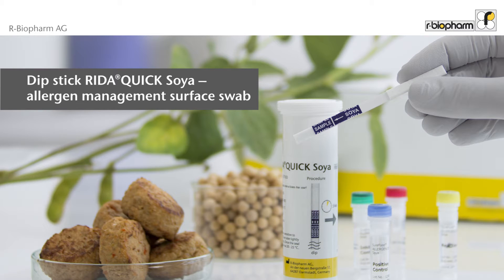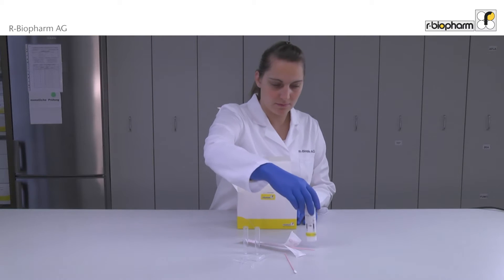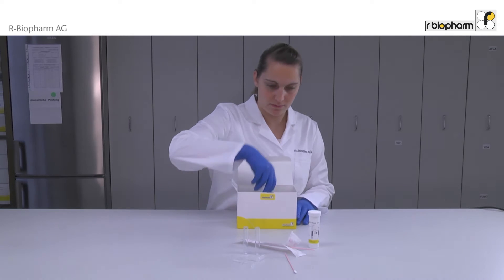The RIDA QUICK Soya allergen management surface swab. This video shows you how to use the RIDA QUICK Soya dipstick for analysis of surfaces and food samples. The test kit contains all materials needed for the analysis of 25 surface swabs.